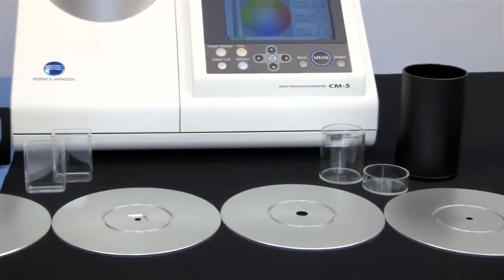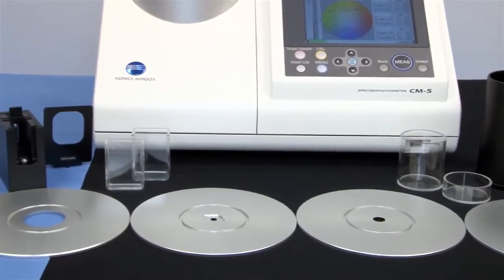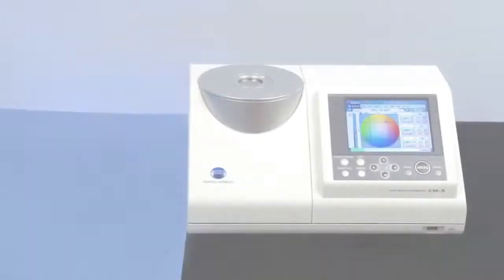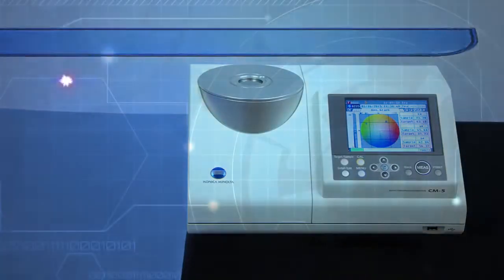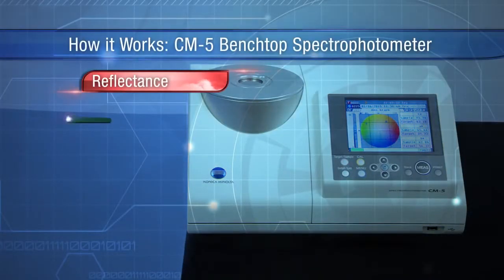A variety of functions and accessories set this innovative spectrophotometer apart. With the versatile CM5, you can measure reflectance or transmittance.